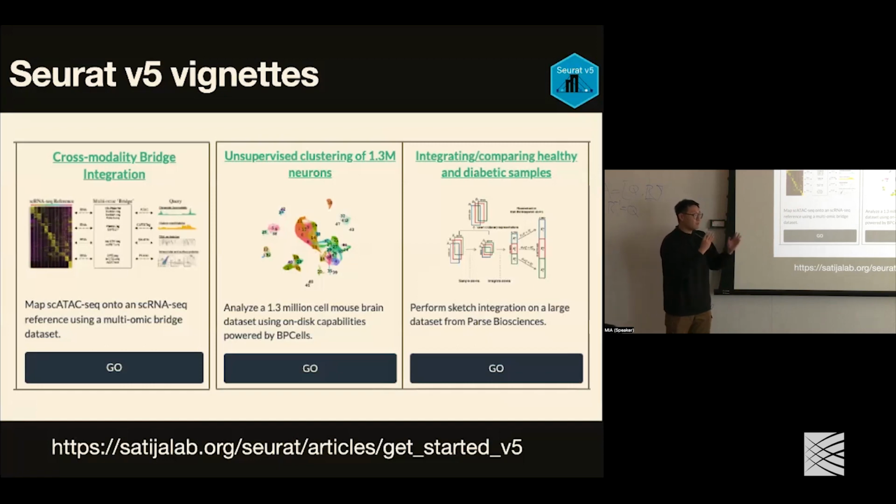That is one way we try to capture the signal from both modalities. That means if you look at the clusters in those WNN graphs, the clusters are not based on a single modality, they're based on two modalities. Because we get those modality weights, we ask, for each individual cell, which modality has more information? If it has more, we use that modality to generate those clusters. Then those things can guarantee that we are not going to lose the information that is ATAC specific or RNA specific.